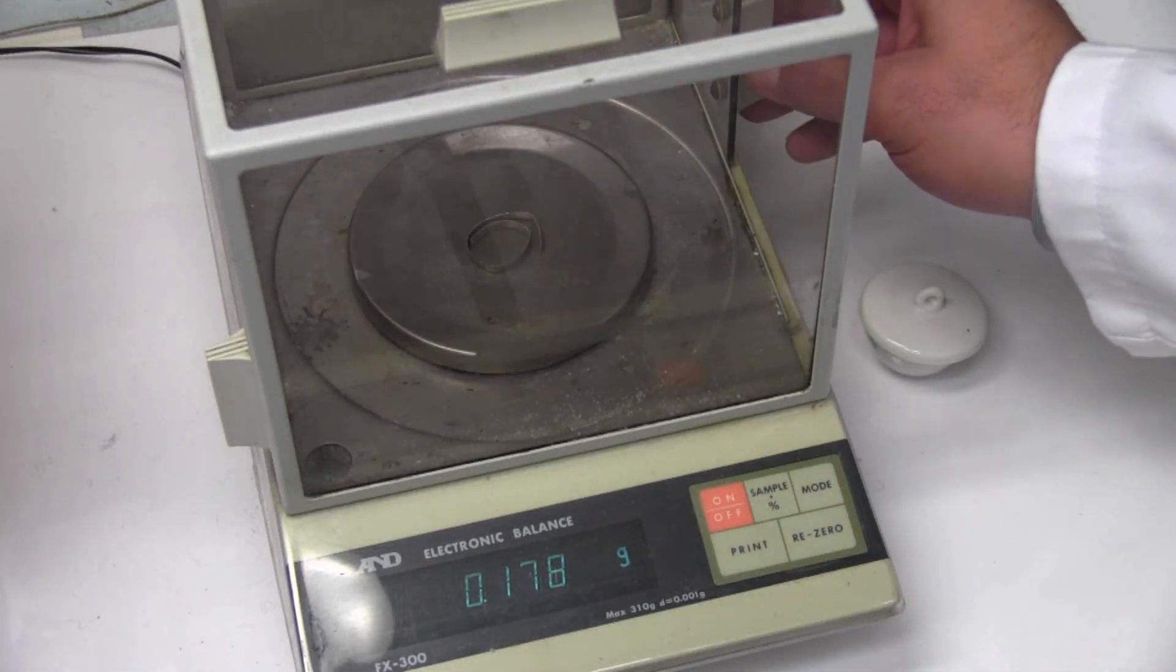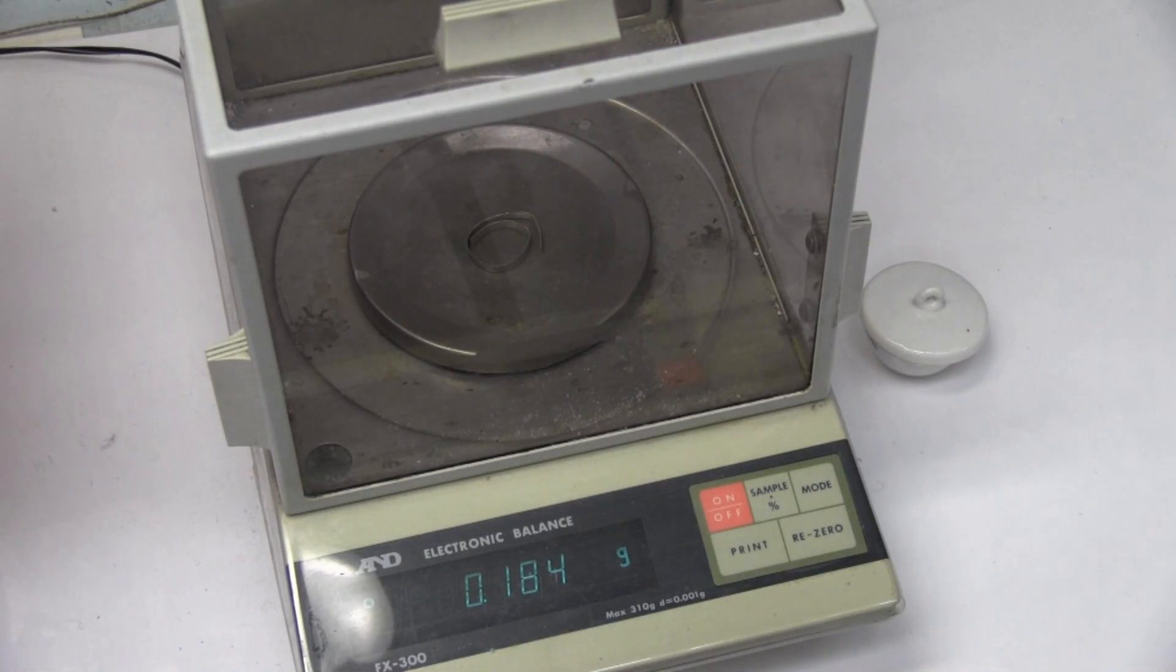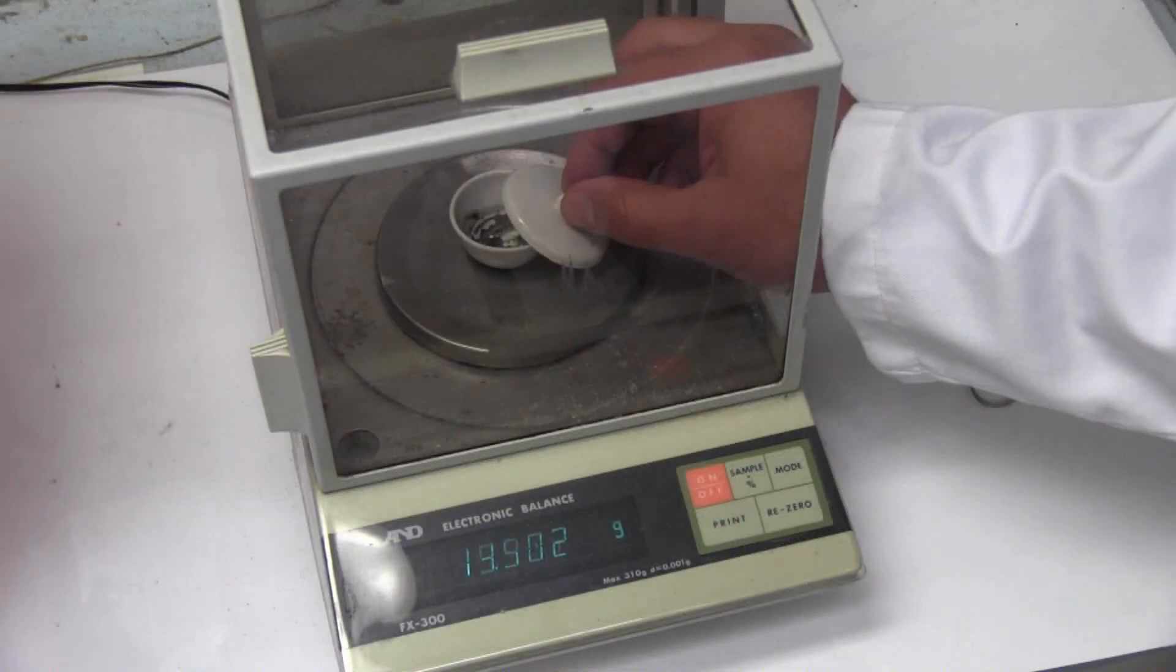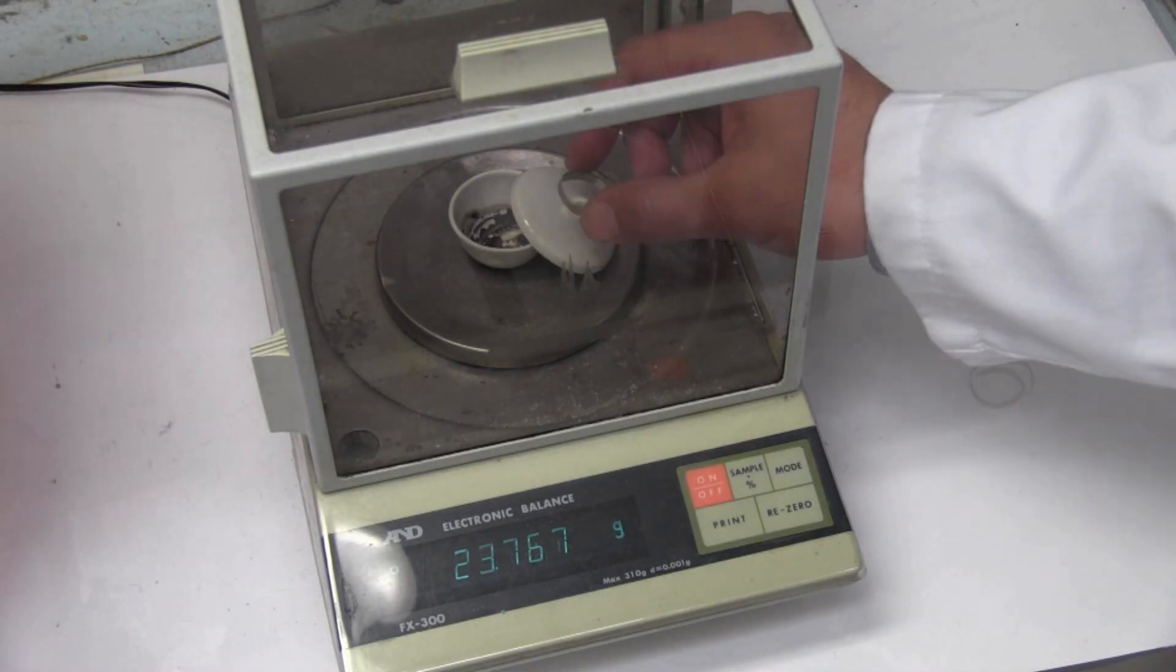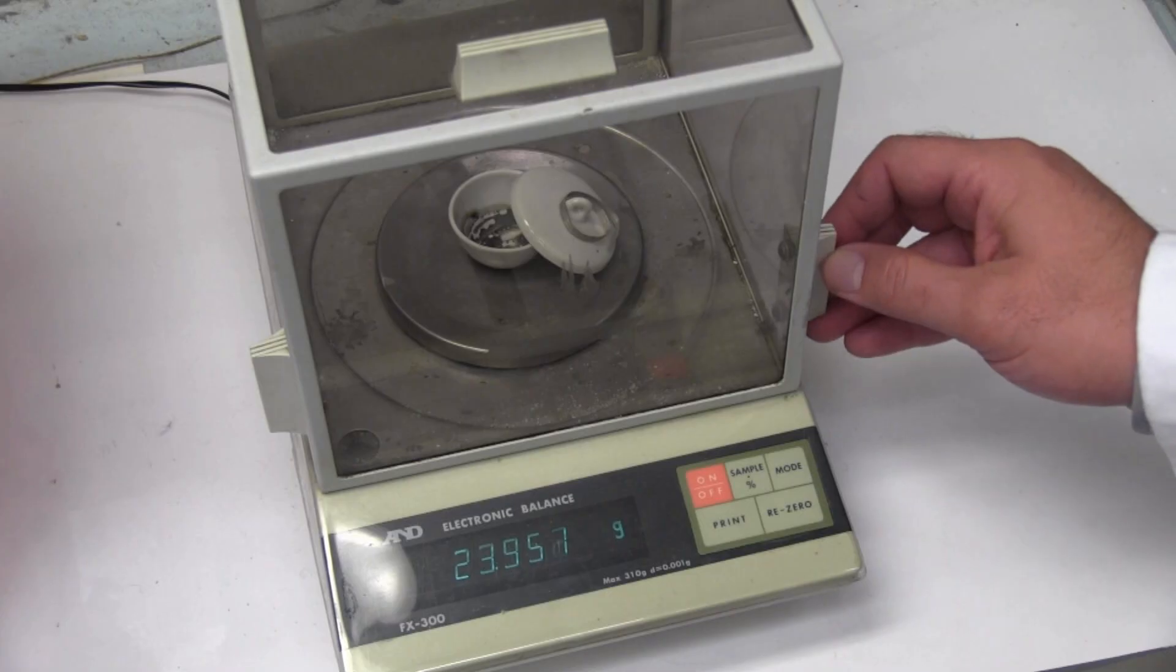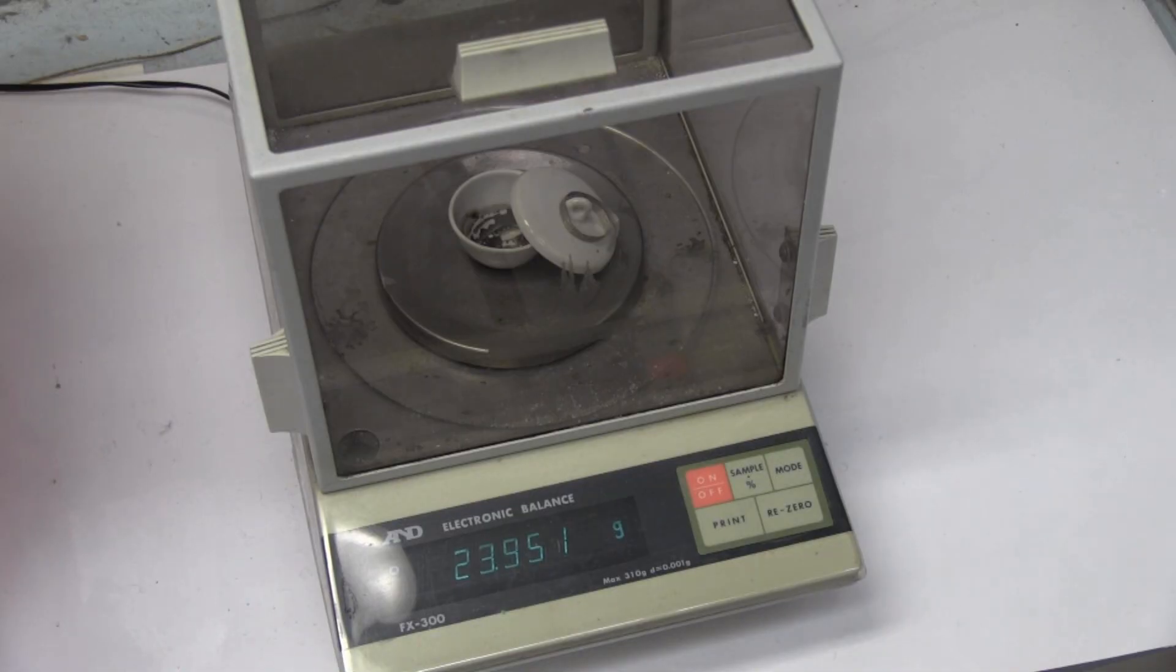This strip of magnesium has a mass of 0.184 grams. The crucible and lid have a mass of 23.767 grams, and the combined total is 23.951 grams.